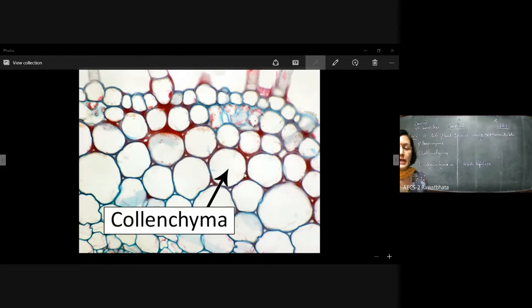Collenchyma has been clearly indicated, and you can see the cell endings. Now a question comes to my mind: will it be visible this way in the compound microscope? That means the microscope that I had just shown you. The answer is no. It really needs further magnification, and with that only you can see such thickenings very, very clearly. The slides in the school can show you some thickening, but this intense clarity will be there under even more magnification.